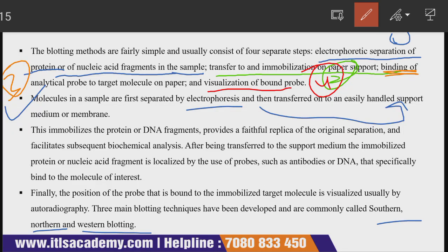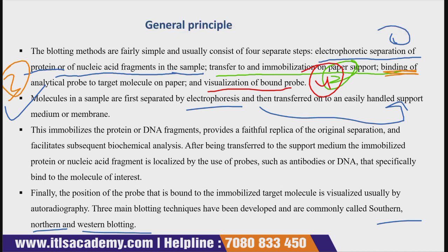In this particular lecture we are going to complete two, Northern blotting and Southern blotting. In the next lecture we will cover Western blotting and Southern-Western blotting.